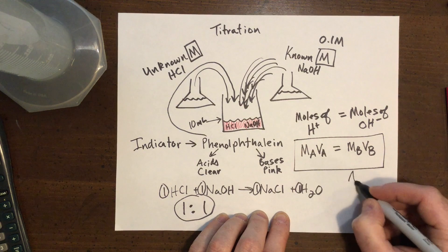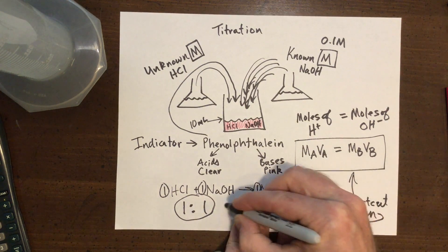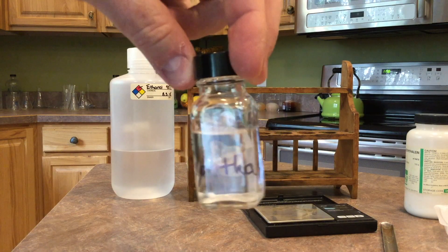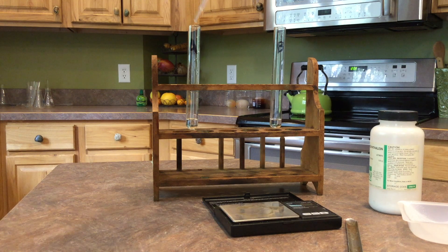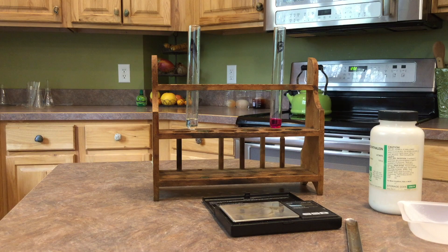Remember, if you're dealing with a situation that's not monoprotic, you're going to have to do a little more math. But in these situations with strong acids and strong bases, this works really well. So here's some of that phenolphthalein. And I'm going to add some drops of it to the test tube on the left, the acid, so you can see that it's still clear.